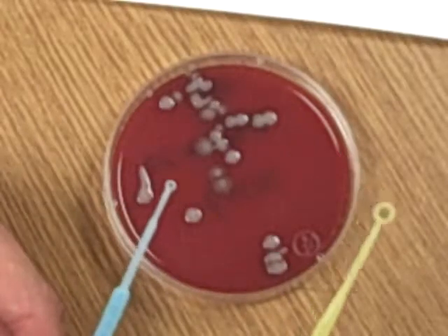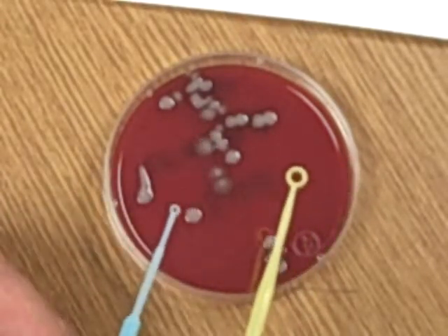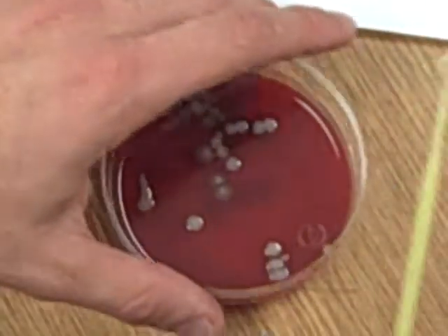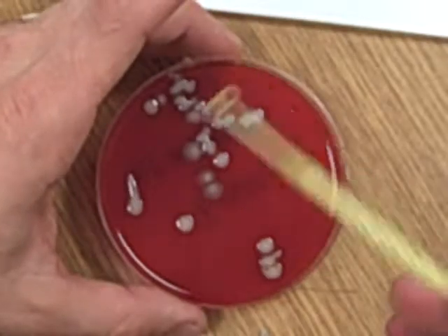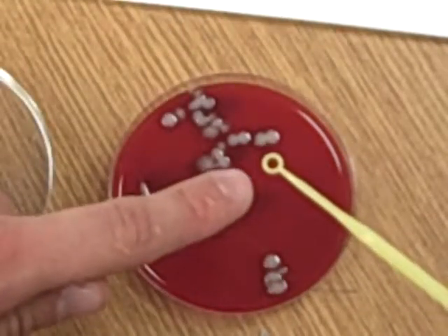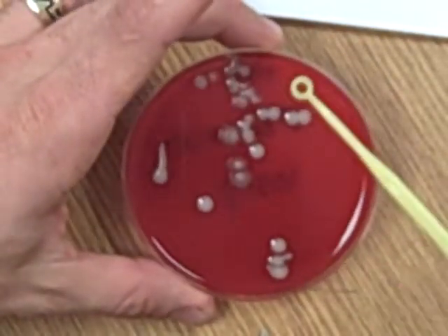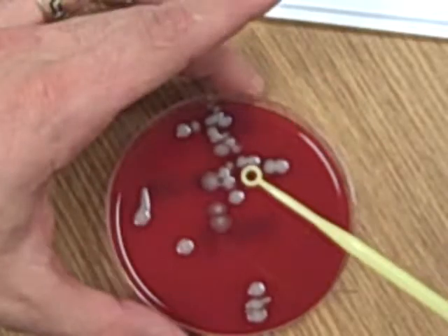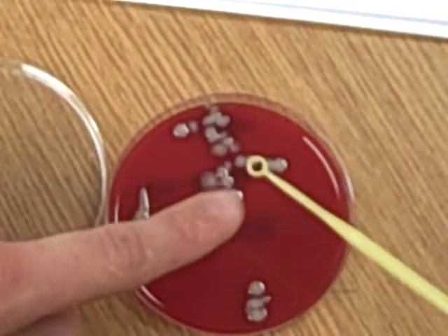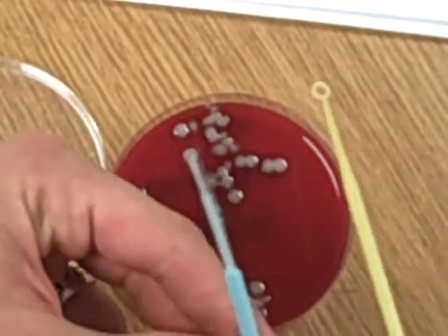So essentially what I would do, I would take one of these loops, whether it's this 1 microliter little blue guy or 10 microliter yellow guy right here, dip it into the urine, and then use it to streak out my culture plates. And what that does is it spreads out the volume of urine that was found in that loop across the plate. Then what grows on the plate is indicative of how much was essentially in that sample, or in the 10 microliters here, or 1 microliter on this loop.